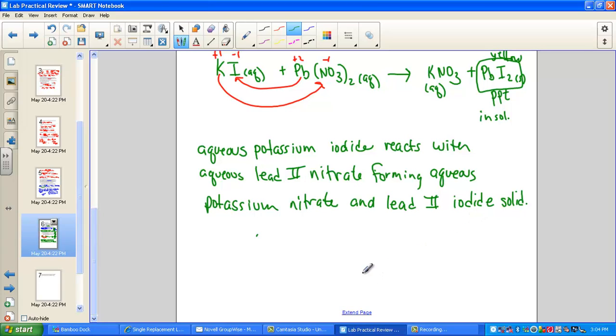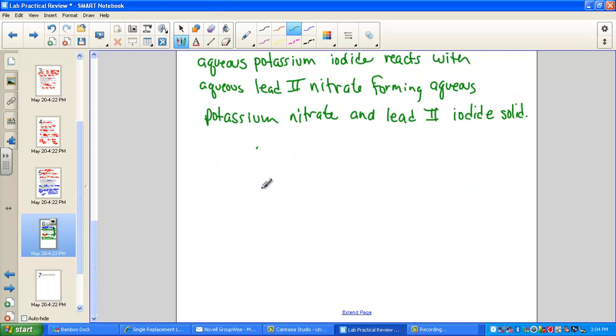Was it endothermic or exothermic? What evidence of change did you note as you were playing a chemical detective? Now the lab practical, 4 parts. Part A and Part B are both quantitative. Measurements matter. Accuracy will be part of your grade. Part C and Part D are qualitative.